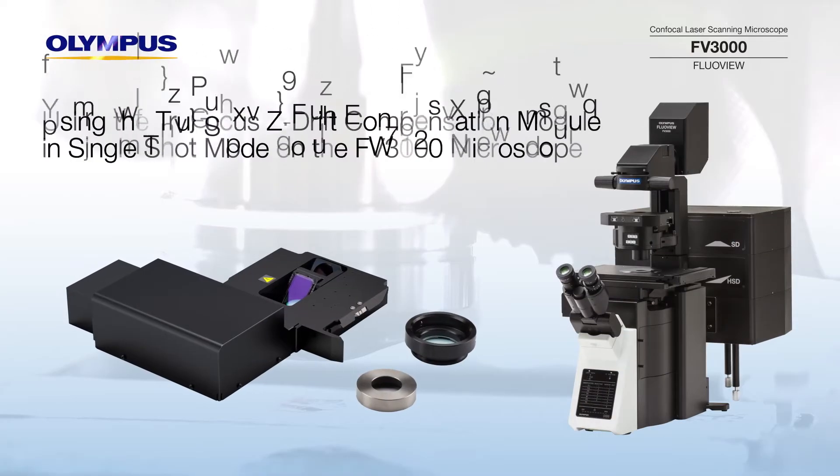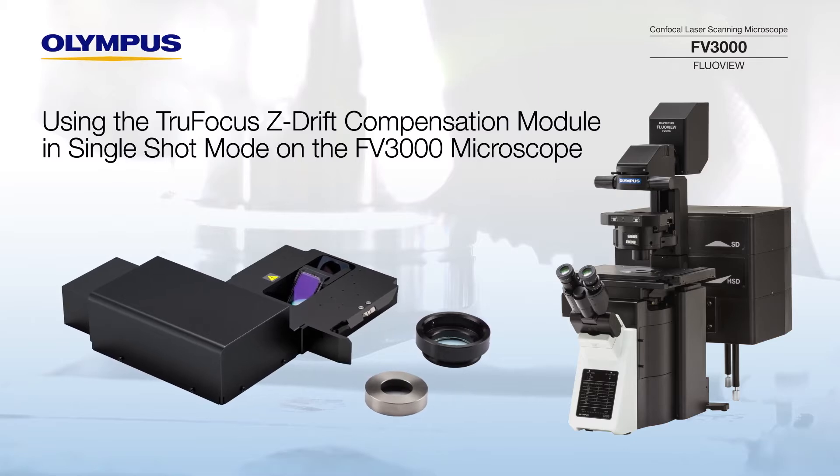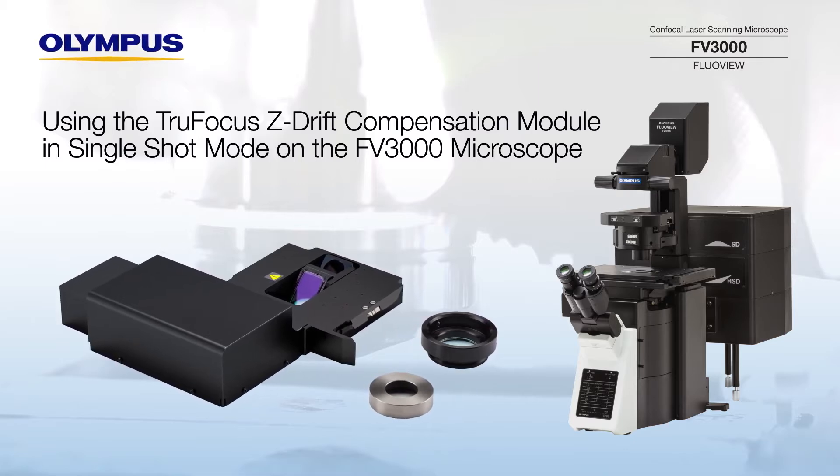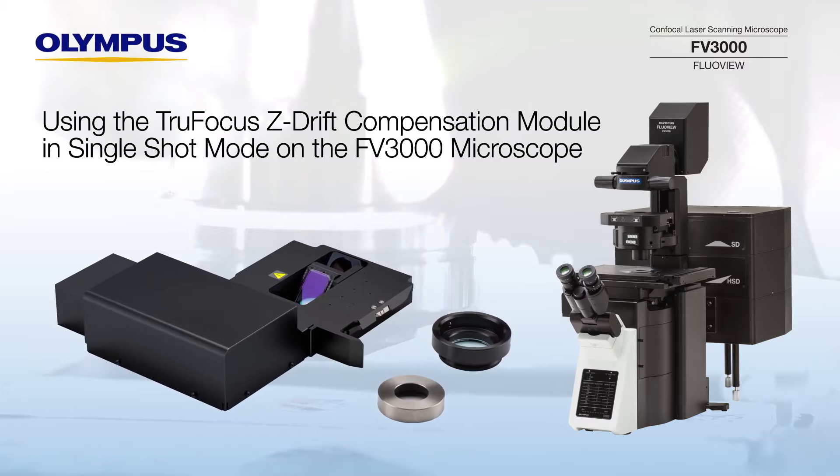This video will show you how to use the single-shot mode of the TrueFocus Z-Drift compensation module when performing time-lapse imaging with long rest periods between frames, which can be susceptible to focus drift.